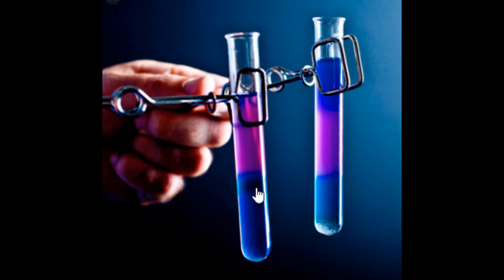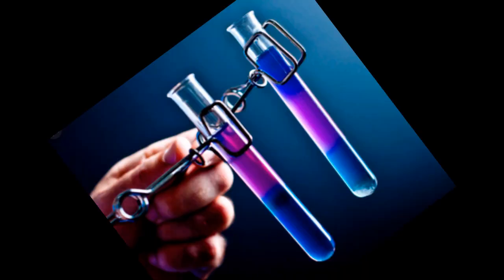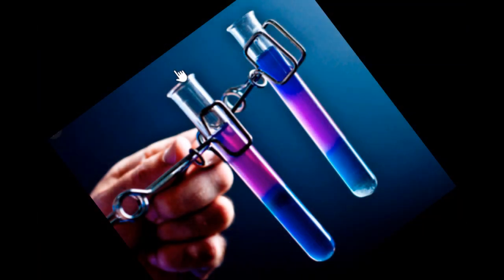So you would actually make sure that you turn this to the side. So imagine now it's on its side, and you would have the flames coming here, and so that the flames would spread out along the entire side of it, but you would have this at its side so that it heats up just along the edge of it. But the important thing is when you're heating it up along that side there, you're going to have it at a slight angle, and you don't want the open mouth of this test tube pointed at anybody. So you would make sure that that is pointed towards the wall, not towards any classmates or yourself.